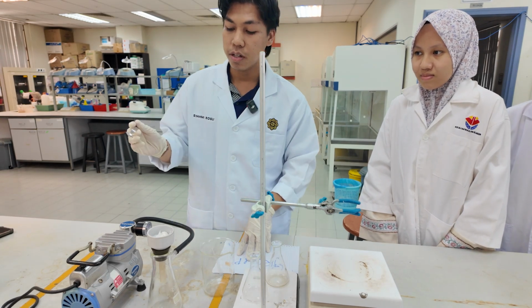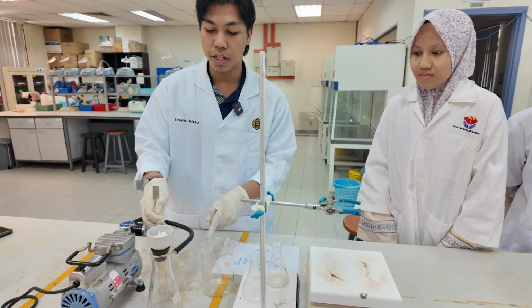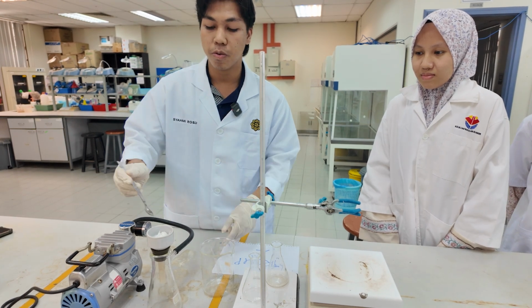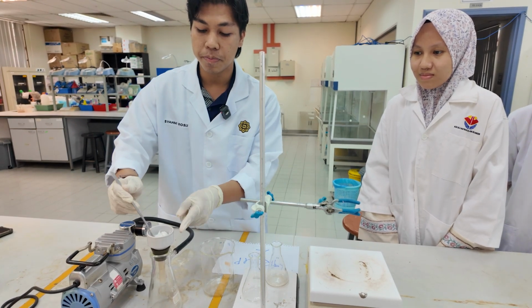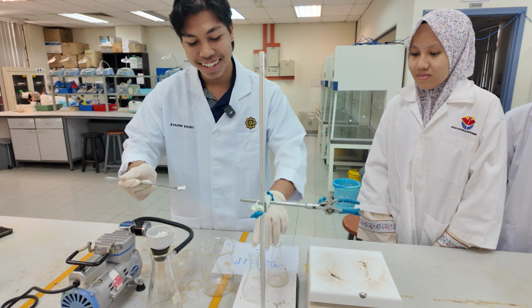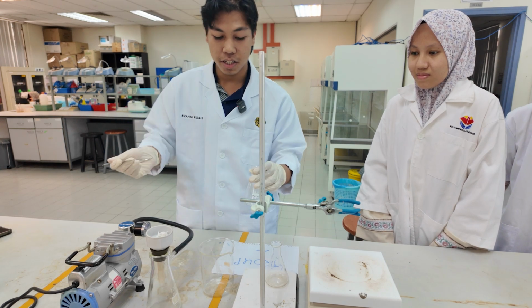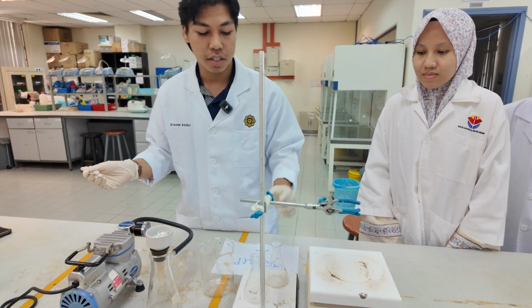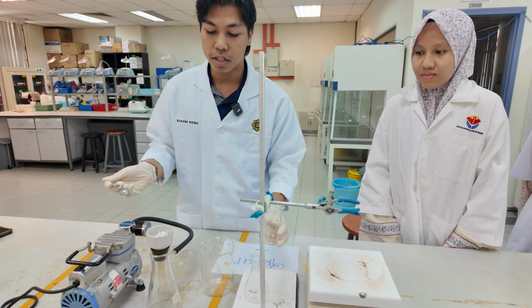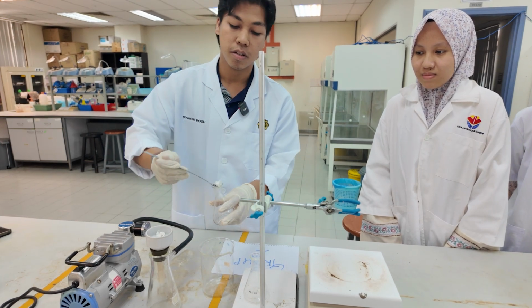What we have to do first, the vacuum here will dry out the solution, and then the solid will form up here, and then we can have something like this. Then we can put it in the conical flask, in the mixture, and when we run another experiment, we can put it in the single flask, like this.